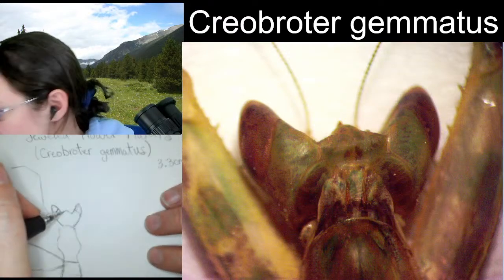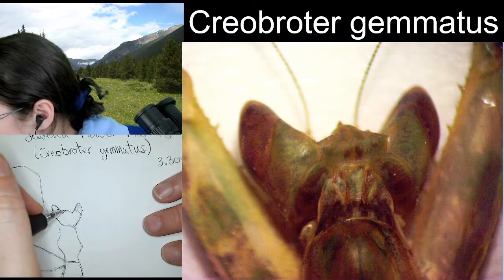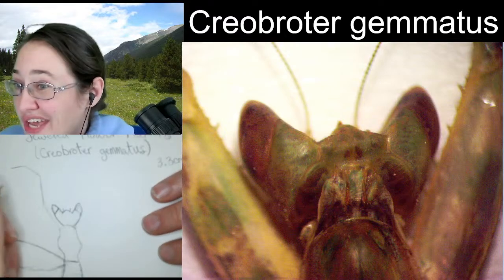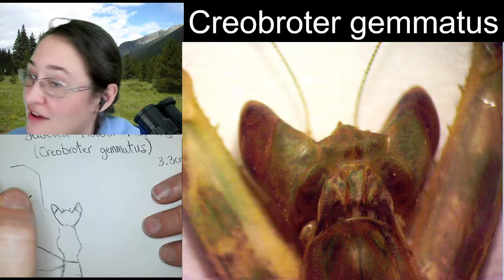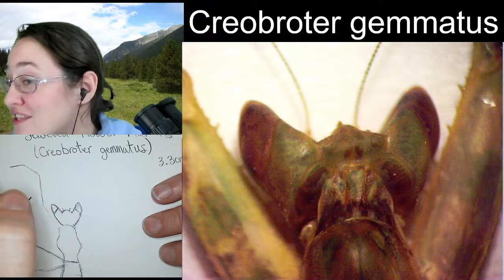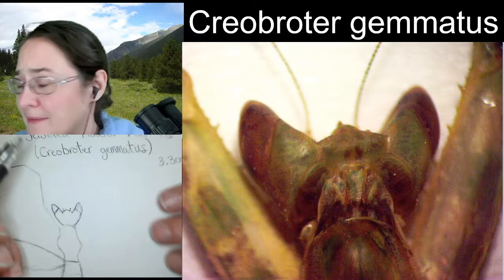The antenna are going to be filiform, or long and straight antenna. They're going to be connected here and here. Mantids are one of those things, just like grasshoppers and crickets and katydids. We don't count the segments of the antenna. There are too many. What we do is we compare the length of the antenna to the length of a body part or the length of the body.